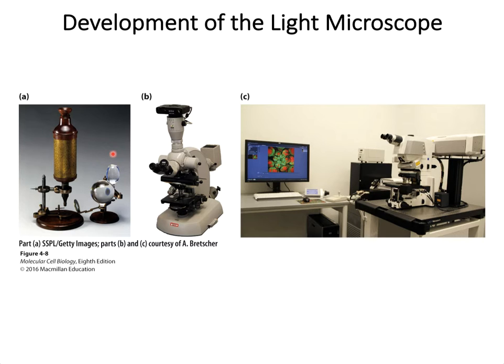Development of optics and the light microscope during the 19th century led to highly sophisticated microscopes by the mid-20th century, limited only by the resolution of light. In the second half of the 20th century, fluorescence microscopy and confocal techniques, and in the recent past, several super-resolution microscopic techniques, pushed light microscopic resolution into the nanometer scale, previously thought impossible without an electron microscope.